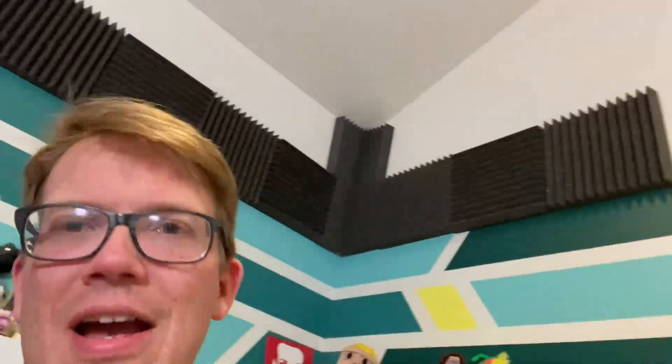I just received all of these different filters. I haven't counted — maybe 33? Probably not exactly 33, probably slightly more than that. Is there one in my tray right now? There is — 34, at least 34.